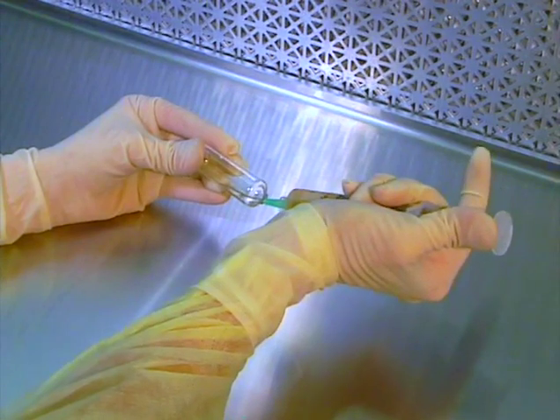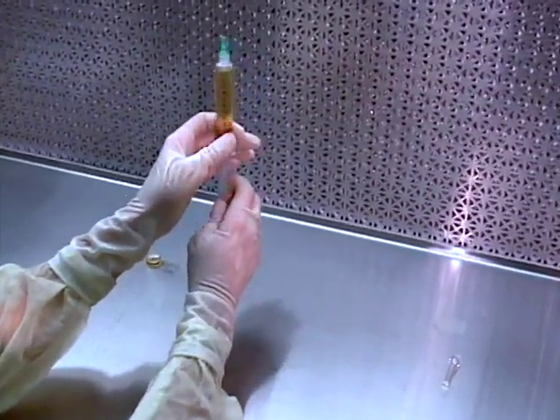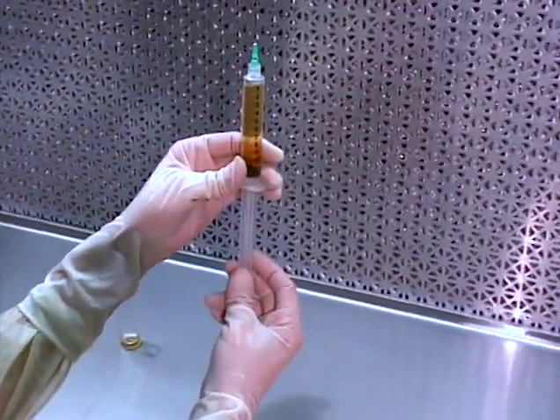To avoid pulling up glass fragments or debris, do not push the needle against the bottom of the ampule. Hold the syringe in a vertical position, eliminate any bubbles, and pull back on the plunger button to clear the needle.